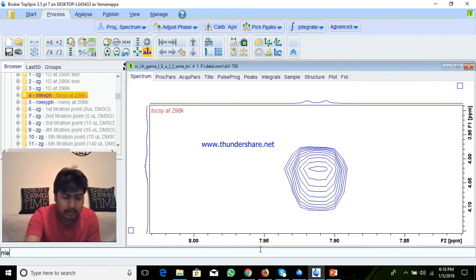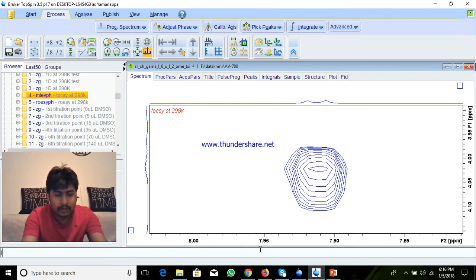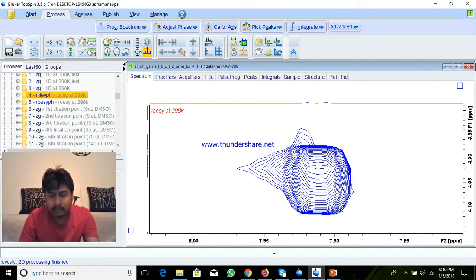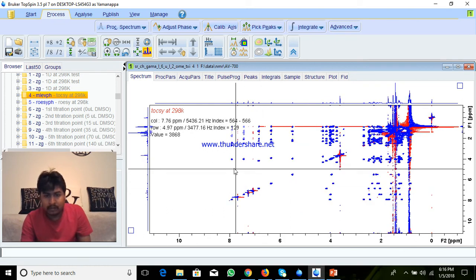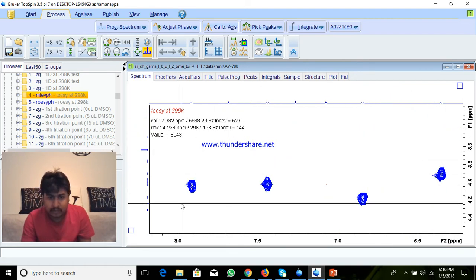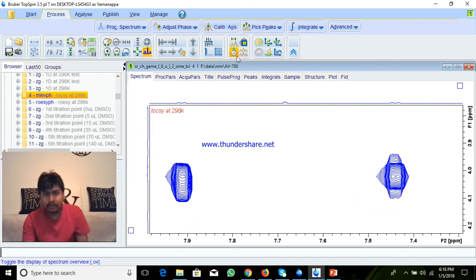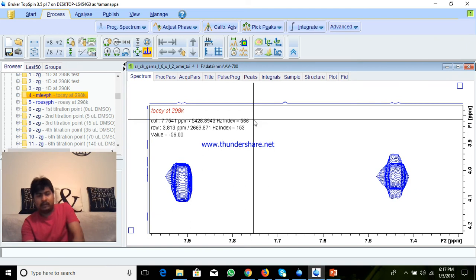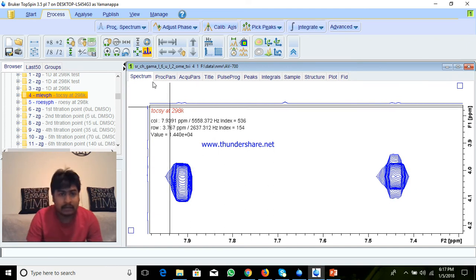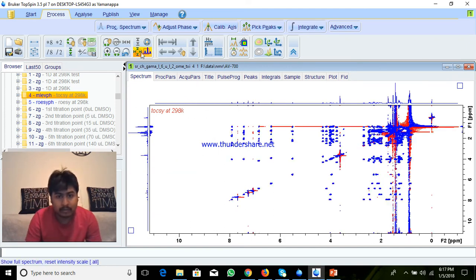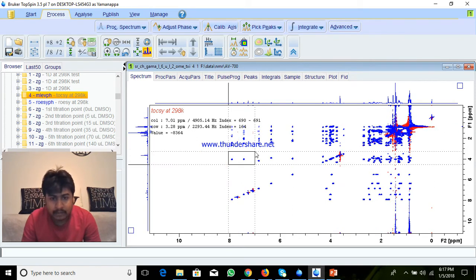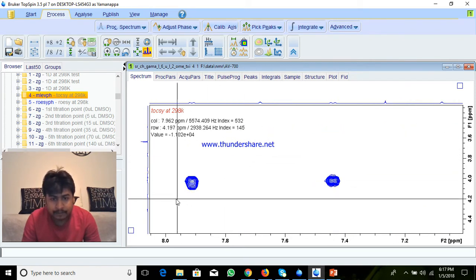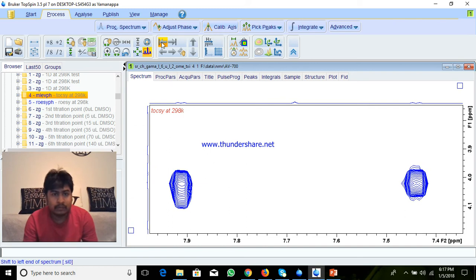This option is calibrate, and this one is peak picking. You can click here, select and drag, and it will pick the peak. If you save and go back, it will save. And integration also — same thing — you can select and drag around the peak, and you can save, and it will save.